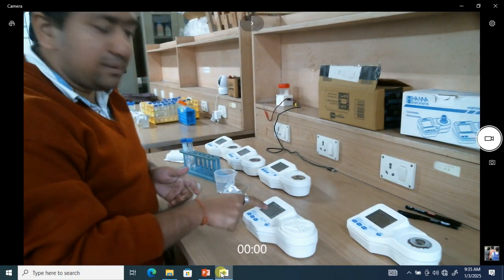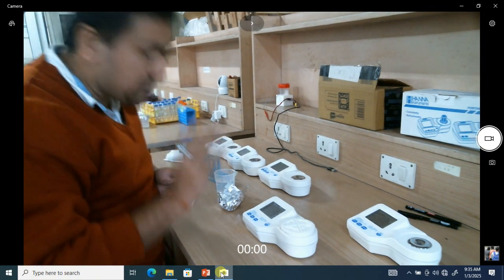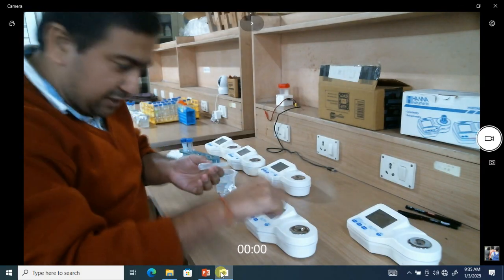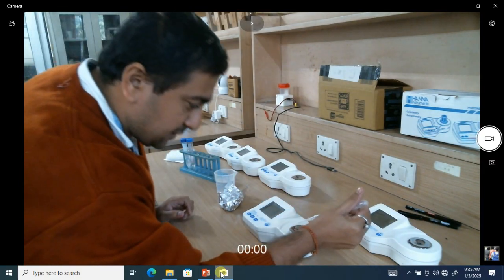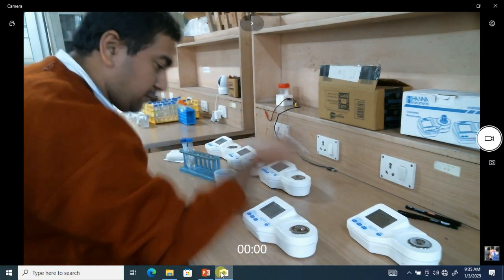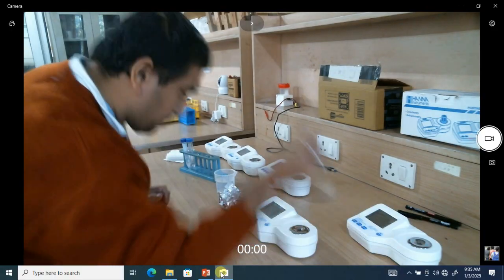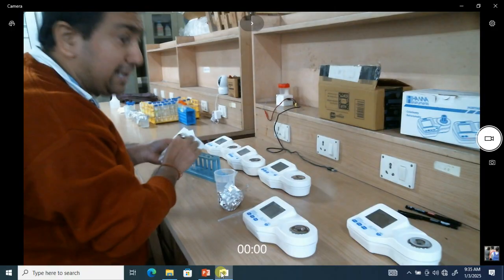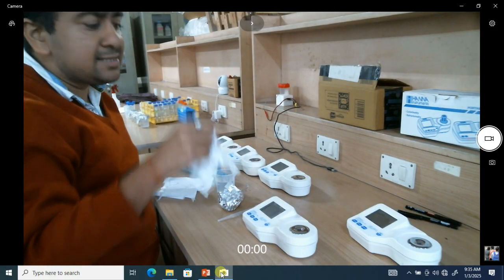Okay. So after this, what we will do? We will simply take out this particular water from the sample holder, and we will wipe it off with a tissue very gently and softly so that your finger stains do not touch the sample holder.